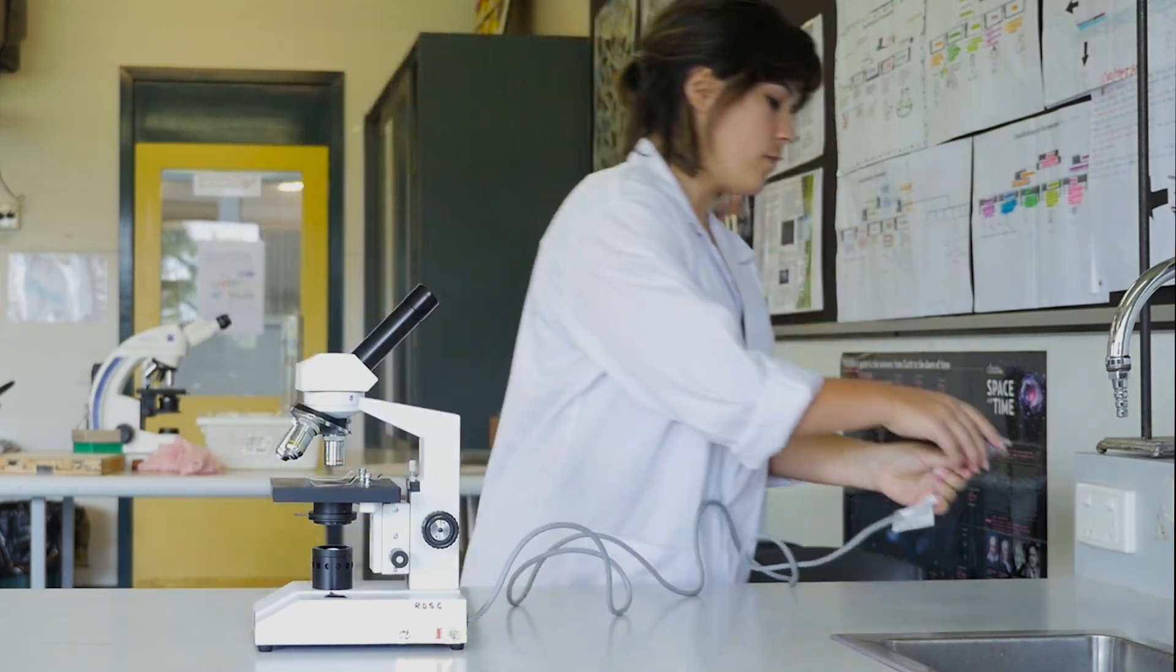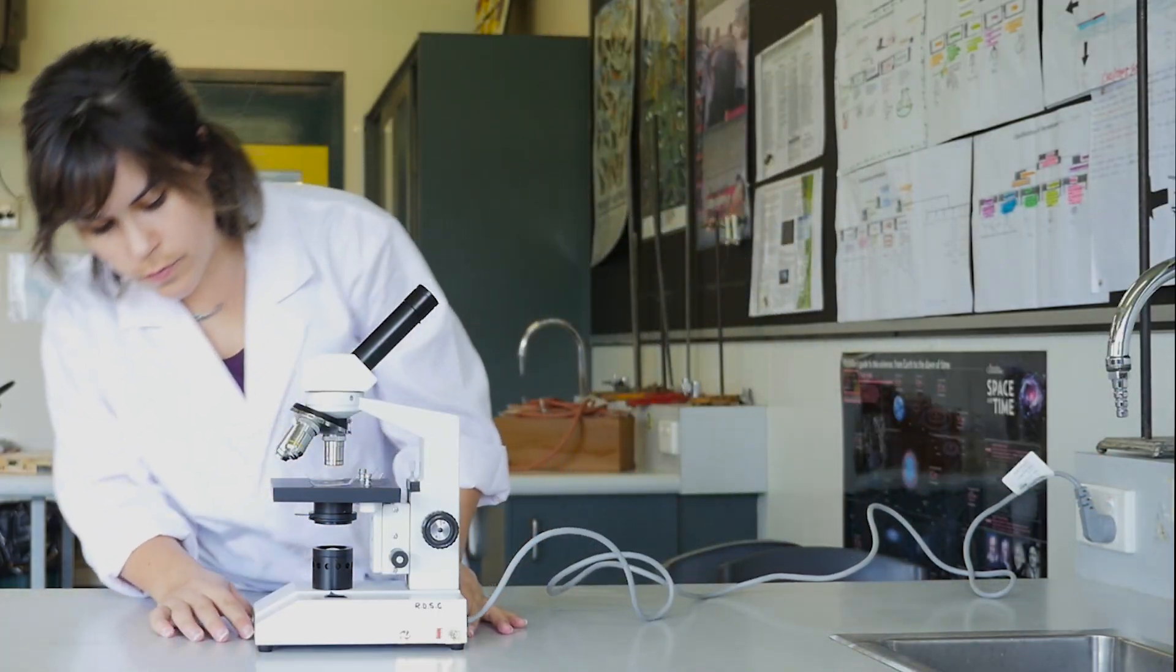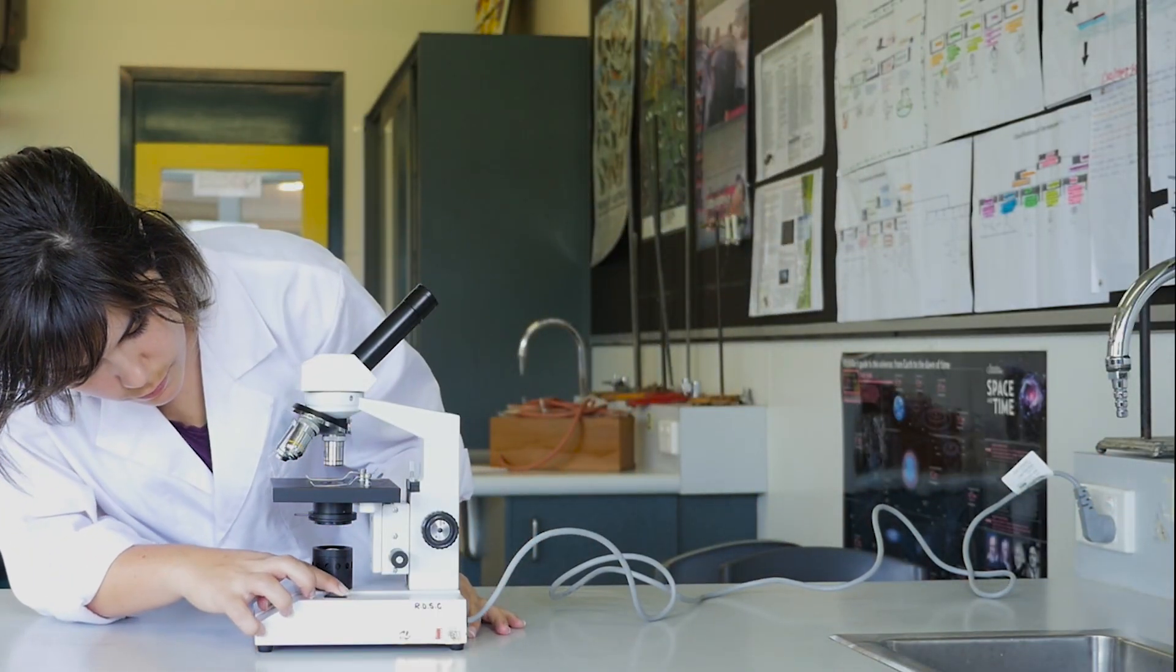Unwind the cord and plug the microscope into the power point. Find the on-off switch. It's usually at the back or side of the base.